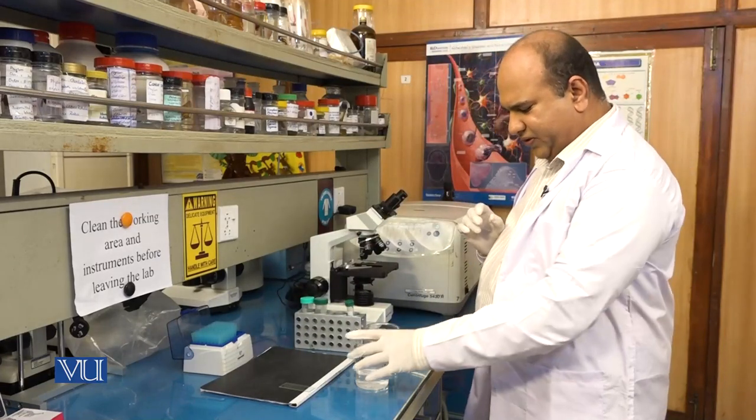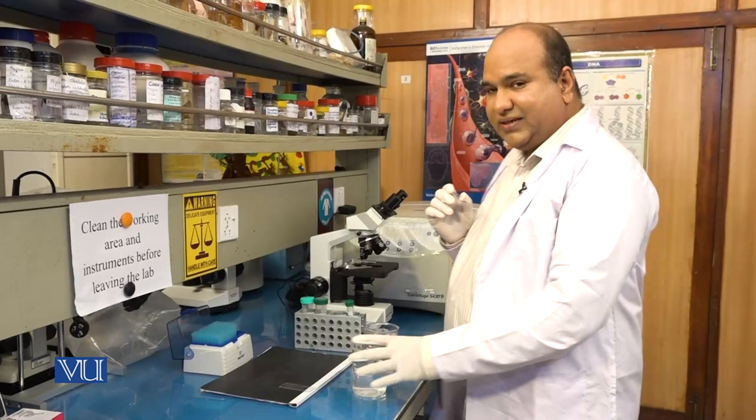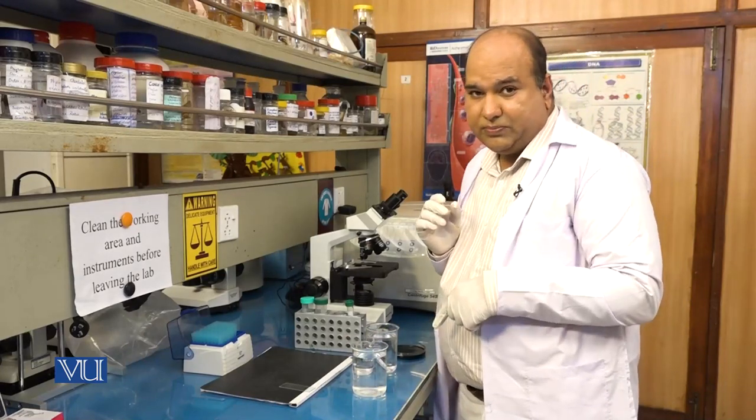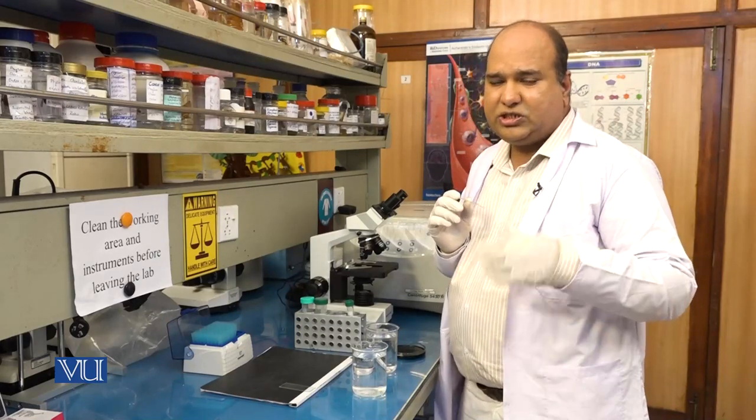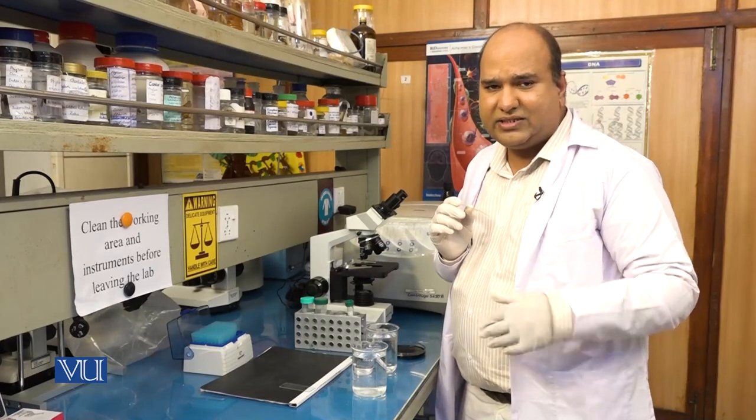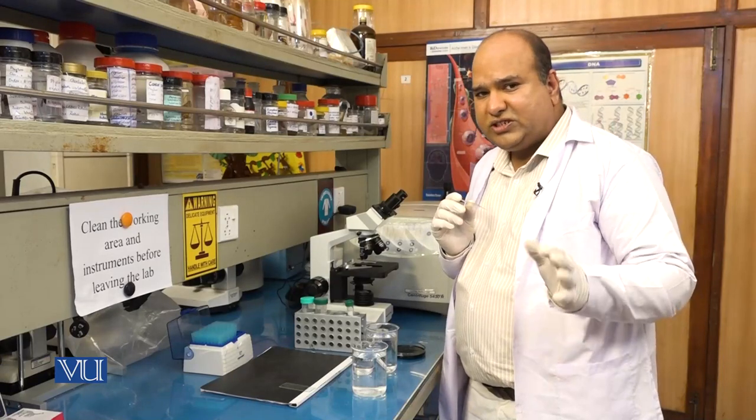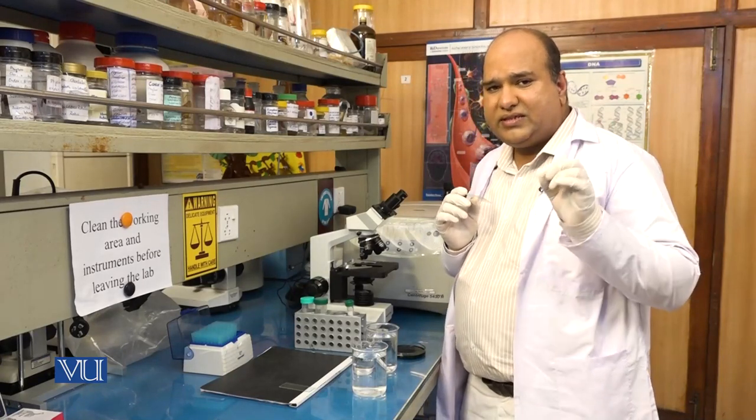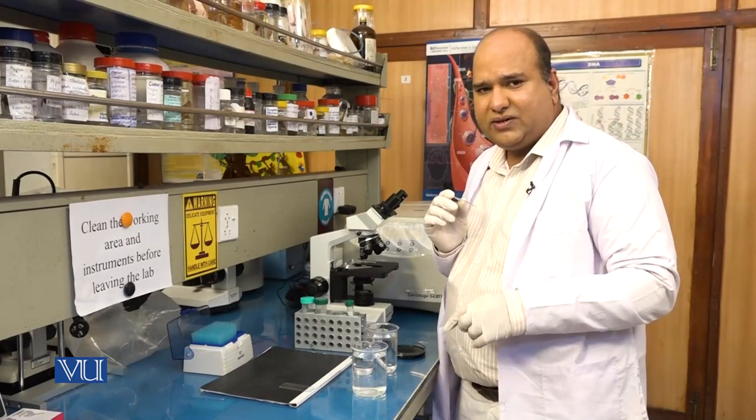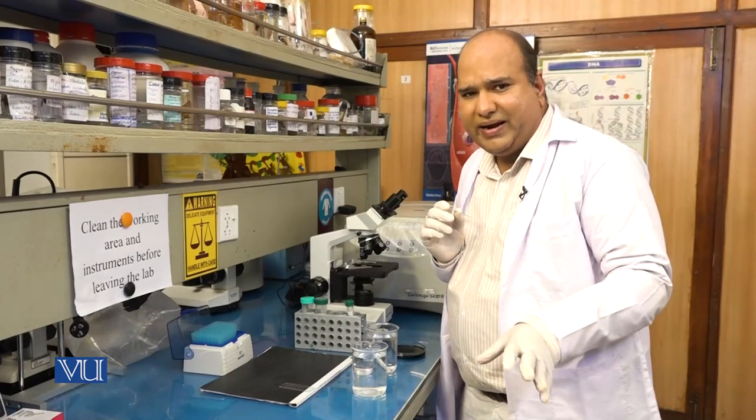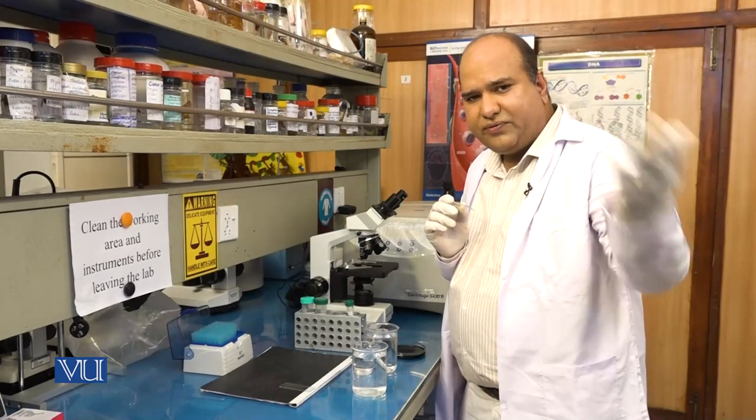Now let's move towards banding process. Before I come straight to the banding, let me tell you about different types of bandings. There is G-banding, there is C-banding, there is T-banding, there is R-banding, there is Q-banding. All these are different types of chromosomal banding, but for the sake of clarity we will focus here on G-banding. Keep in mind that the chromosomes are of different composition.